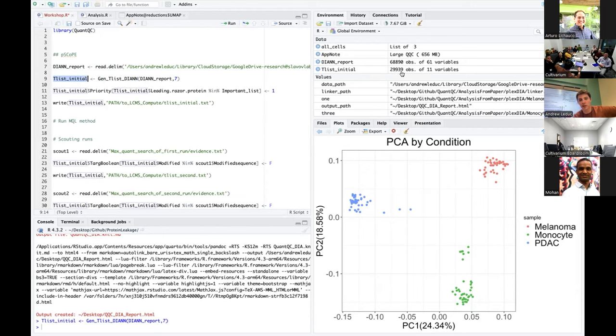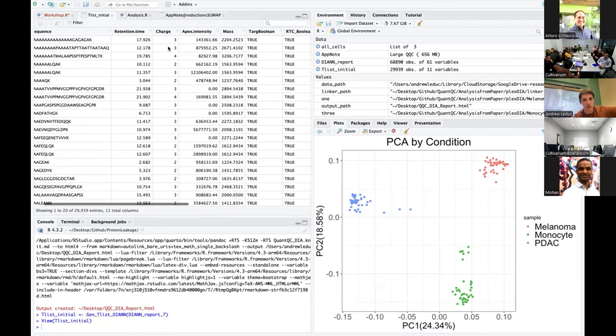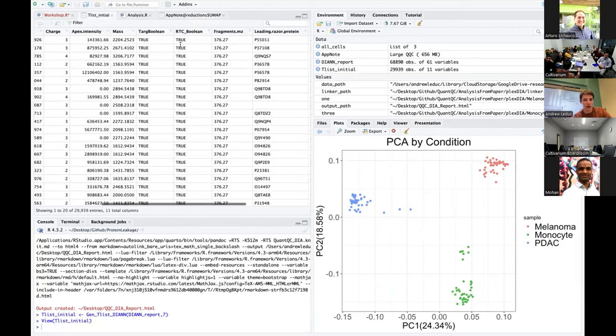You can see it has 30,000 rows. That's how many peptides we detected from the TMT run. This is how many things we have the option to tell the instrument to go after. So you'll see there's a couple of columns, stuff you obviously need: retention time, what's the charge and what's the mass. Those are the two big things that we need, right? And the apex intensity, we want to know, is this one of the more intense things? Is this something that we need sensitive DIA methods to see? Or are these things that we could maybe easily get with a data-dependent acquisition method?